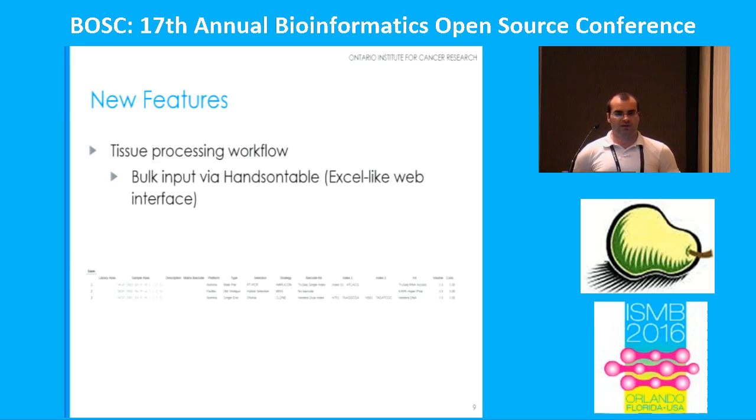So we've built a customizable workflow that allows you to say, okay, I started with a person, they have provided these tissue samples, we have taken these tissue samples, put them through these procedures, done these kinds of chemical steps as well as physical steps and enrichment processes. For instance, if we do an array-based hybridization to capture a subset of the DNA, we want to know what was going on there so we can track all of that when it gets time to process it computationally.